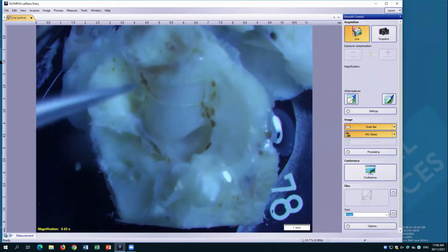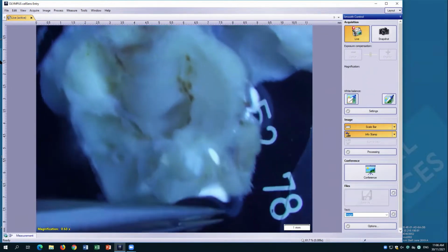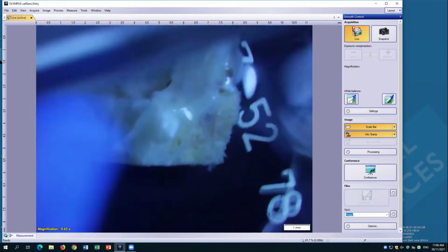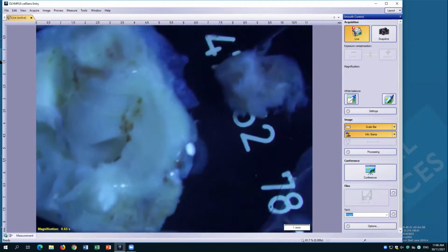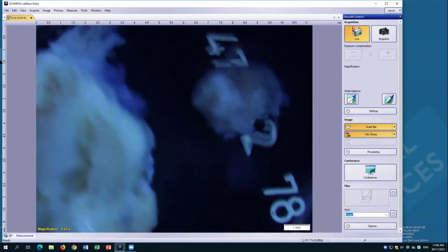Okay, so shown right here is a sheep cochlea, and I am as magnified out as possible, but this dissection microscope is very good. And shown on the side here, this guy here, this is a rat cochlea. So I might just focus on the rat first.